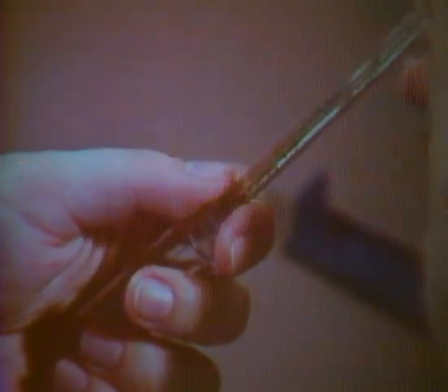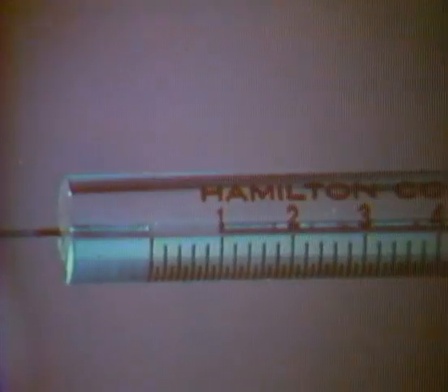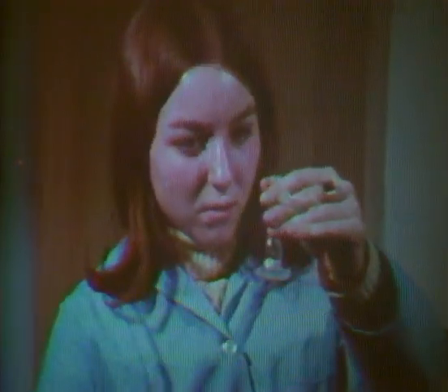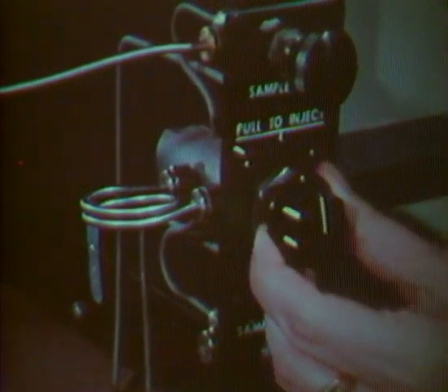The sample requirement of a gas chromatograph is very small. For a liquid sample, about a microliter or less. It is easily and reproducibly handled with a syringe. Solid samples are best dissolved in a volatile solvent and the solution injected into the carrier gas. The sample volume of a gas is usually less than 5 cc's, readily handled by the larger syringes. For more accurate injections, gas or liquid sampling valves are available.